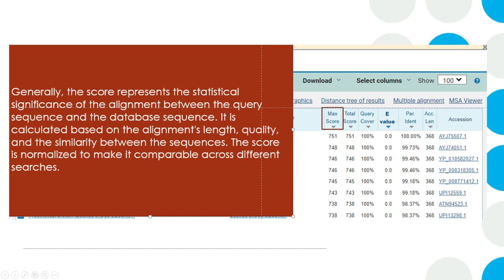In other words, there is no universal maximum for this score, and it depends on many features related to the input and the database. Usually this score must be high when selecting the sequence related to the input sequence.